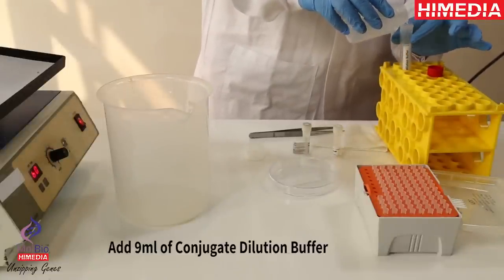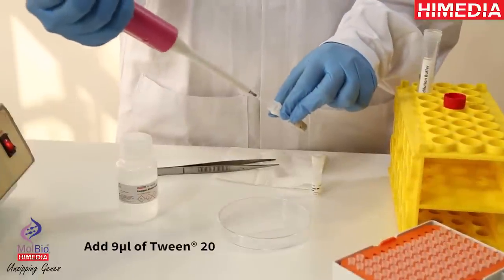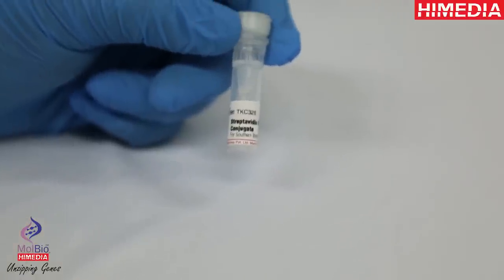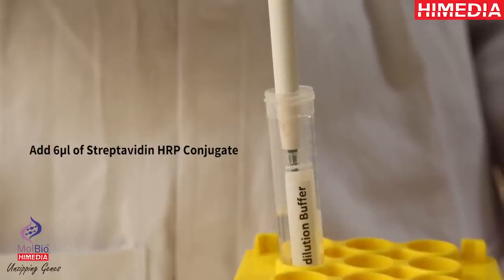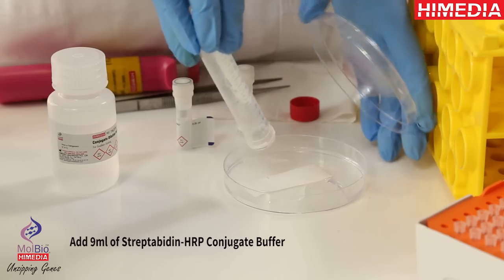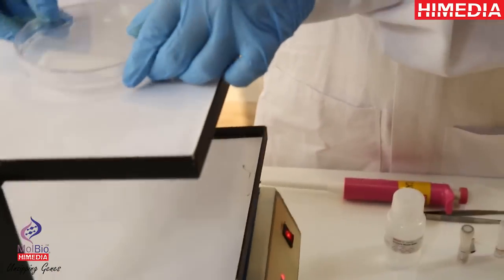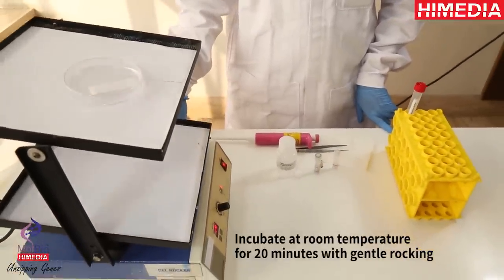Add 9 ml of conjugate dilution buffer. Add 9 microliters of Tween 20. Add 6 microliters of Streptavidin-HRP conjugate. Add 9 ml of Streptavidin-HRP conjugate buffer. Incubate at room temperature for 20 minutes with gentle rocking.